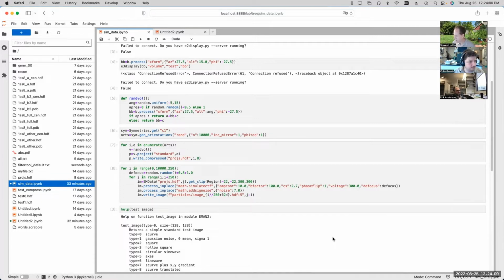And that's a very, very strong, low resolution object, right? Almost all the information in that object comes from the fact that the mean density inside the circle is different than the mean density outside the circle. Applying the CTF to that object helps make it more realistic, but it does not undo the fact that you simulated this really strong mean contrast difference between the objects.